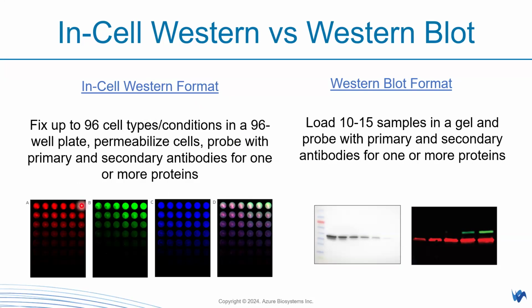Okay, and the idea here is every well, one well representing one data point. So we're looking at one well as if you're looking at a band on the Western blot.